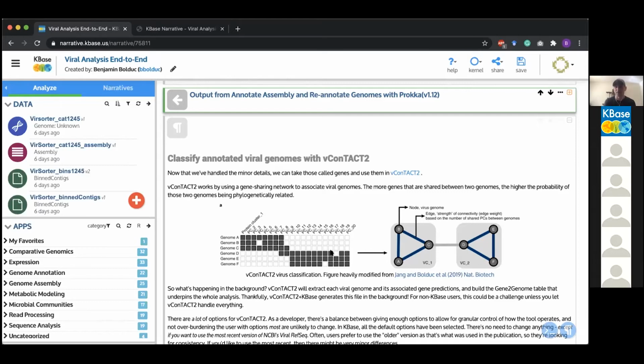Don't use those as clear and fast measures, because every virus group is different. You'll find some that don't have a lot of genes being shared, but they're still highly related. And then you'll have some that are seemingly identical, but are definitely not in the same species.